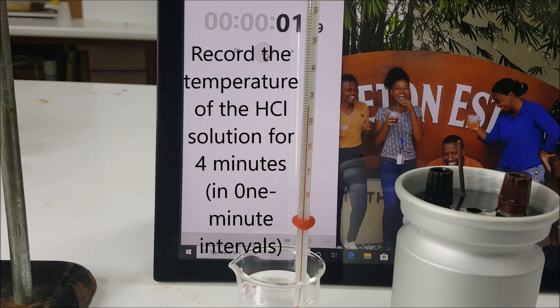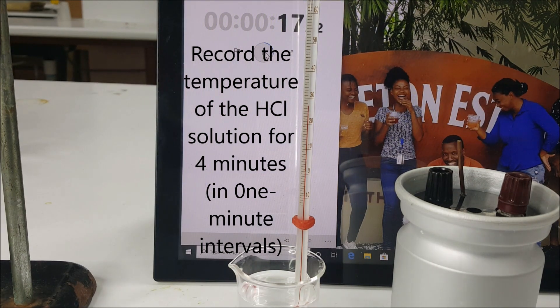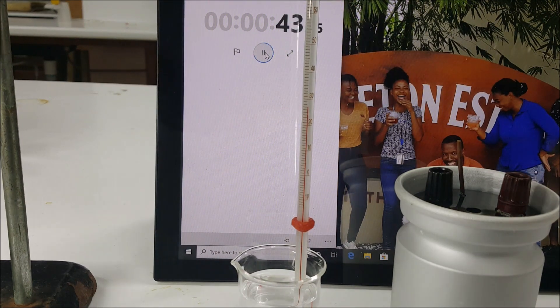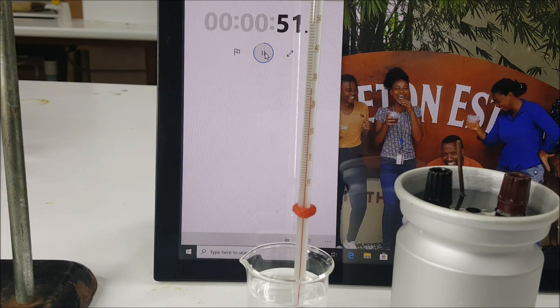We start the experiment by measuring the temperature of the hydrochloric acid solution for four one-minute intervals. The clock will be running for the entire experiment, so focus on the times. There will be points where you can pause the video and measure the temperature, so make sure you pay attention throughout the entire procedure.